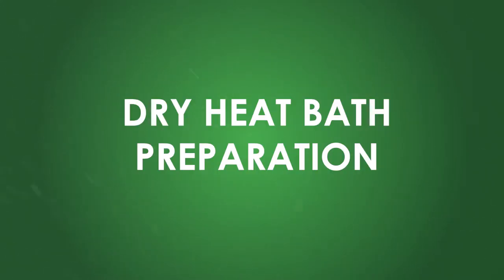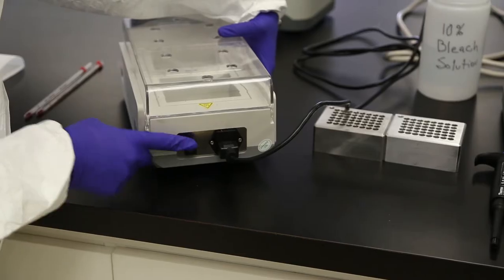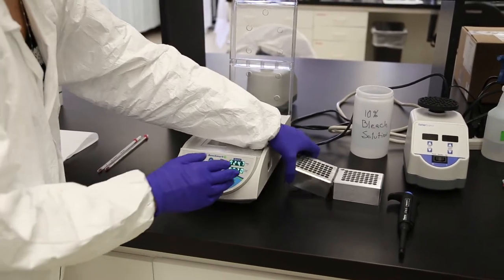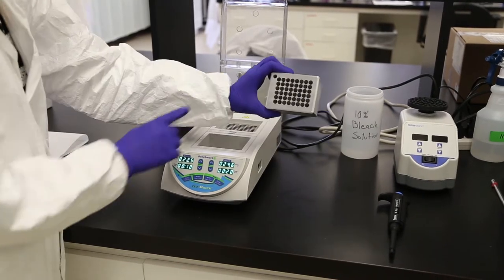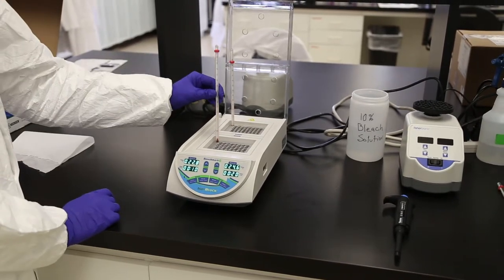Dry heat bath preparation. While the reagents are adjusting to room temperature, you can set up your dry heat bath units. Follow the manufacturer's instructions for calibrating and oiling the dry heat bath units your lab uses. This video demonstrates the setup of a benchmark dual dry heat bath and a single BWR dry heat bath. Turn on the dual blocks main power source by using the switch located on the back of the unit. Fully open the lid and place a 48-hole aluminum block into each of the slots. Then place a thermometer into the offset hole in the corner of each block.